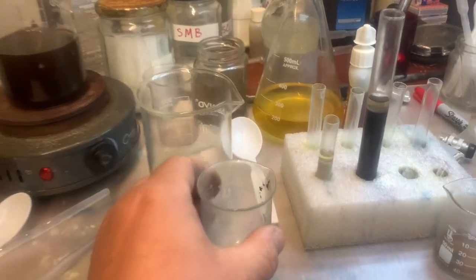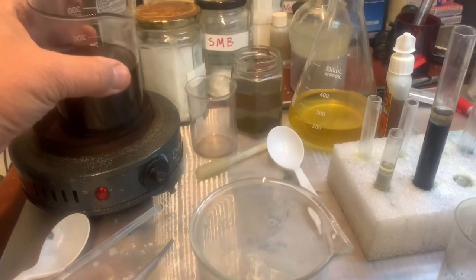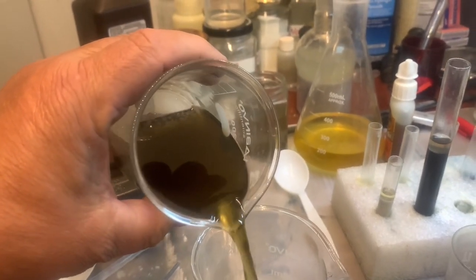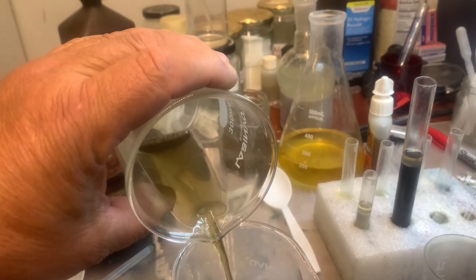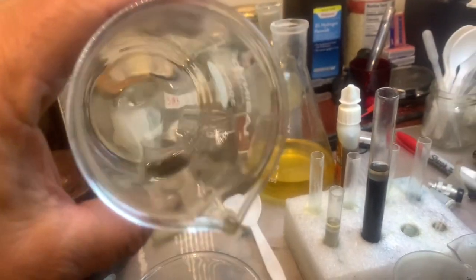Let's continue. So let's collect all the gold what we have. Slowly I throw this juice out. There'll be very little amount of gold, but you know, we need to collect everything what we have. Okay. Now what is left is a gold.